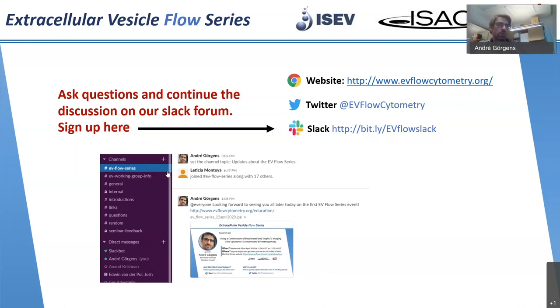Yes, two good questions. The reproducibility we have tested to some extent by comparing how the results change if you apply the same EV sample to that assay. So that is something we have done. We have not comprehensively looked at reproducibility between batches. We have seen some batch variation, definitely. And we also have seen different backgrounds, sometimes in different lots. So that's definitely something one has to control for and has to be careful with.